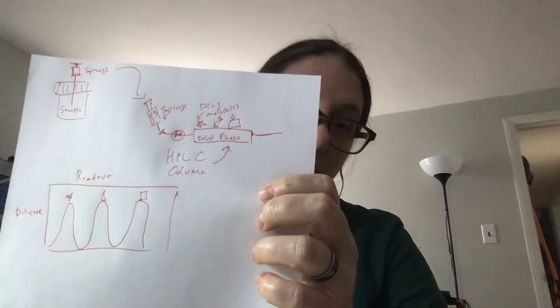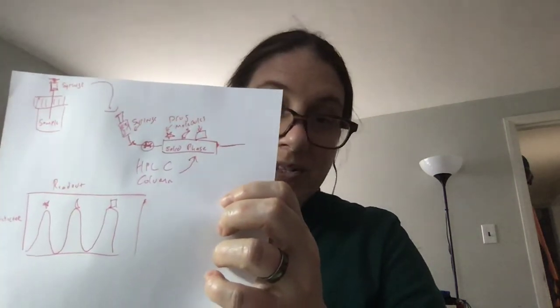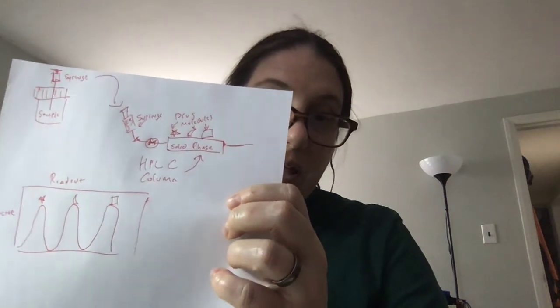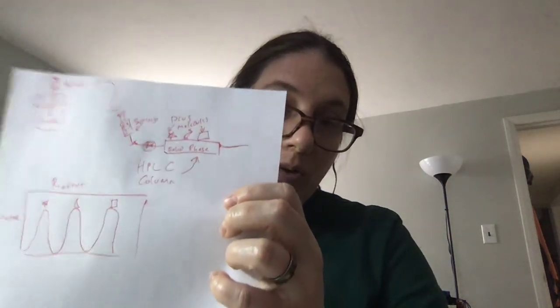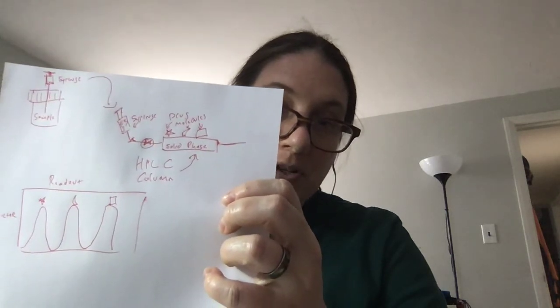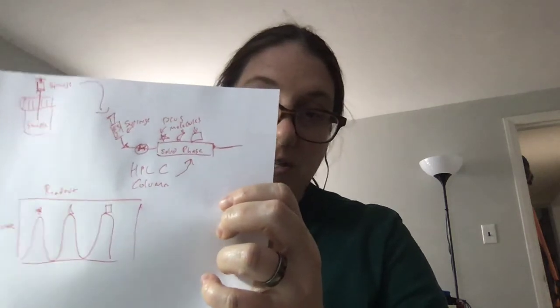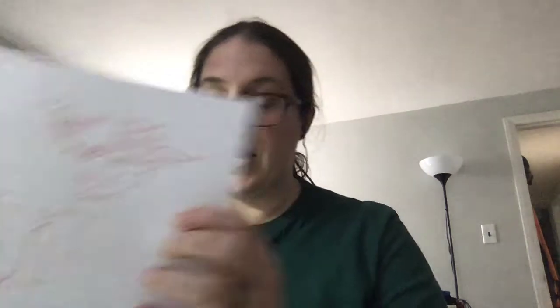Since those peaks could be very little sample, less than a nanogram, the way that I'm probably going to want to do that is using mass spec, because mass spec is a lot more sensitive than something like NMR. It has a higher sensitivity, and so that's why I'm going to use that.